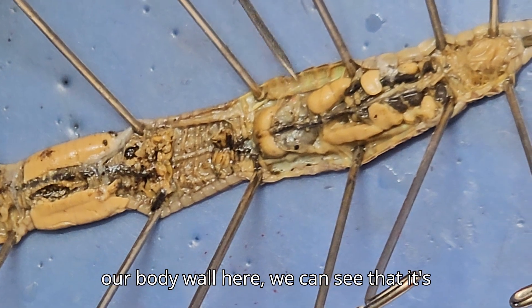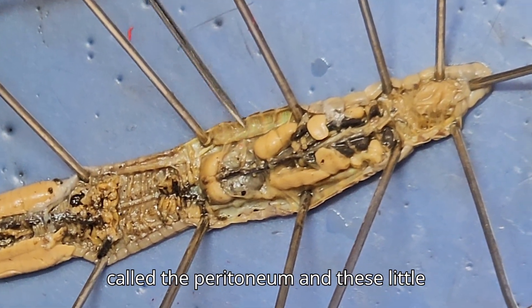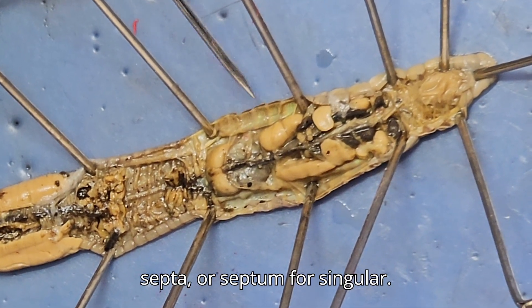If we look at our body wall here, we can see that it's kind of shiny. That's from a membrane called the peritoneum. And these little lines here are called the septa, or septum for singular.